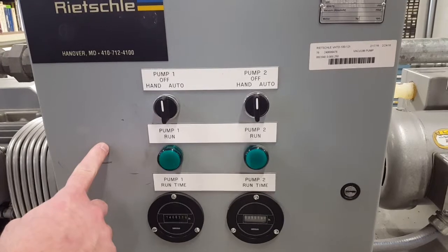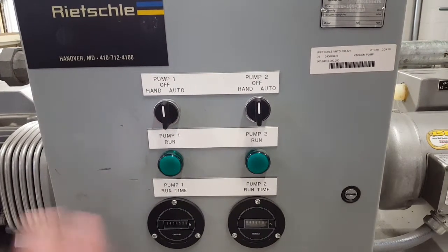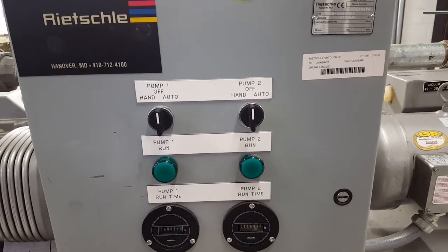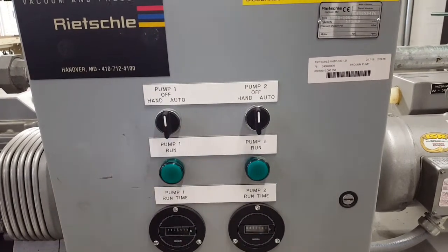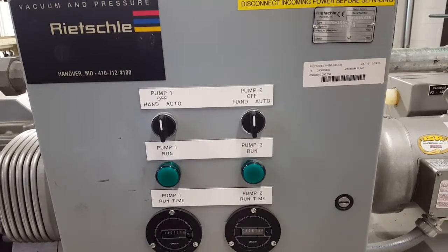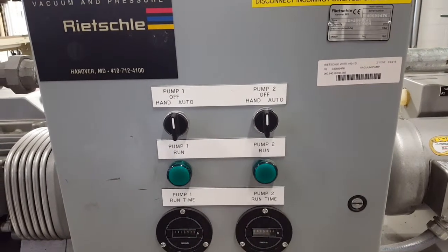Inside, there's a PLC module that will turn the pumps on alternately based on the pressure switch. When the pressure goes back, it puts an input to the PLC, which will turn on pump one, and then when it bleeds back again and the pressure switch hits the PLC, it will turn on pump two to bring the pressure down to the vacuum level.